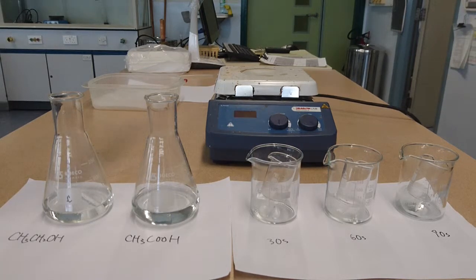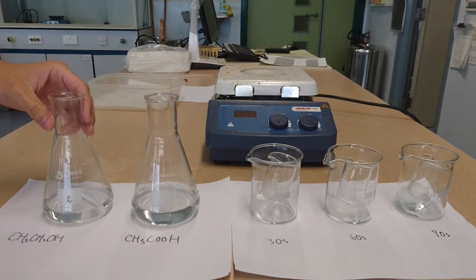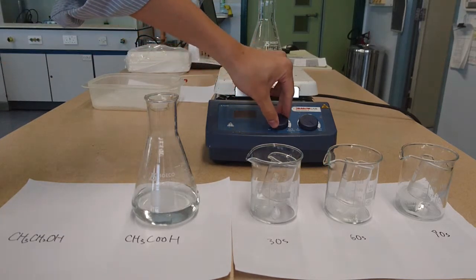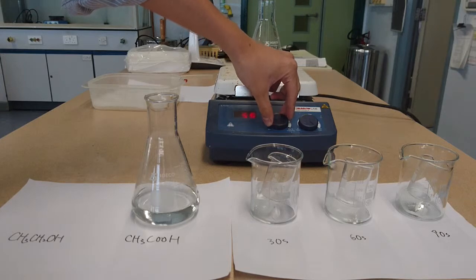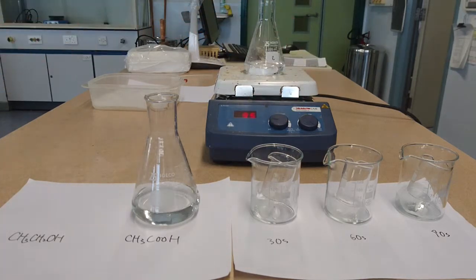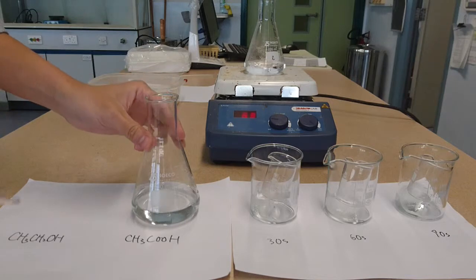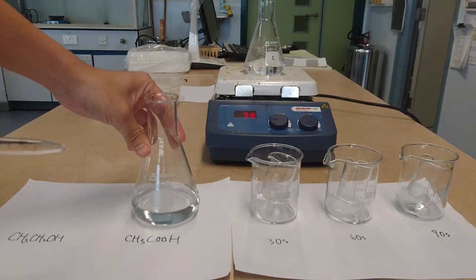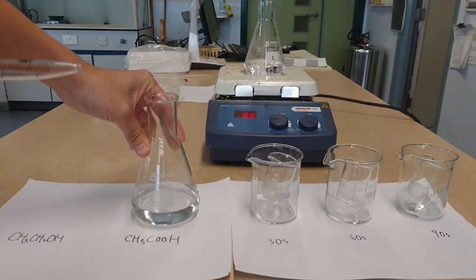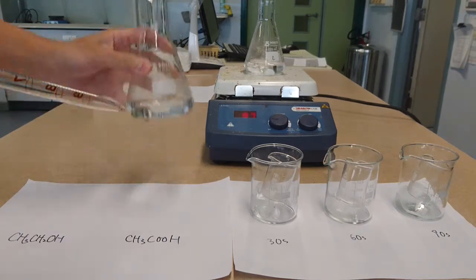Firstly, we have to have a hot plate to increase the rate of reaction. Now, it's not yet the start of the reaction. I just put it here, and it is stirred by itself. I mean, there is a stirrer here, and now it says 80, okay, make it 95 degrees Celsius. What I should do next is add the acid here. At the time I add in the acid, there will be a reaction, and we will call that time 0. So I add in now.